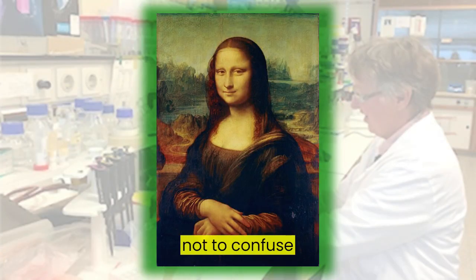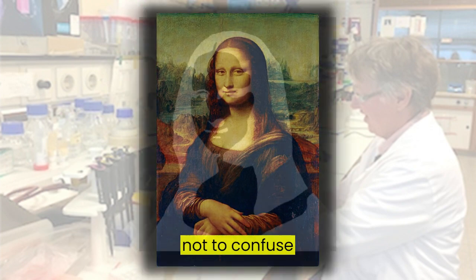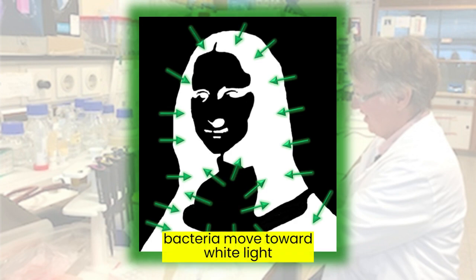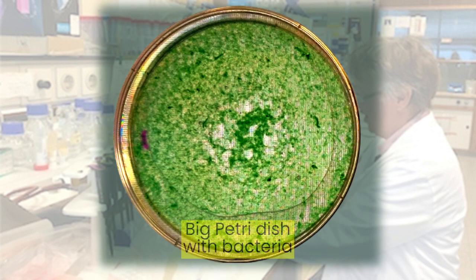No, not this one! I meant Mona Lisa! Not to confuse cyanobacteria, let's make Mona Lisa in two different colors, only black and white. The bacterial cells will move towards the white color. Let's take a big enough petri dish and disperse some amount of cyanobacteria cells there.